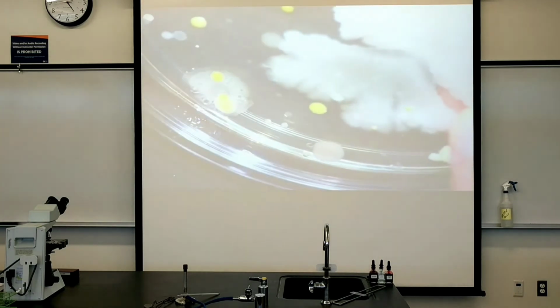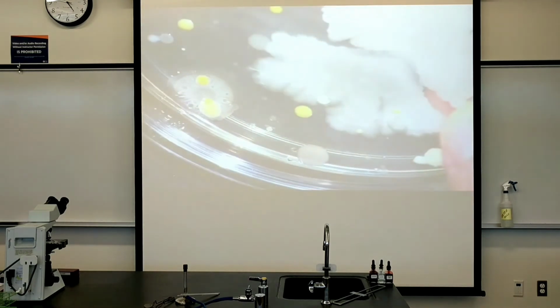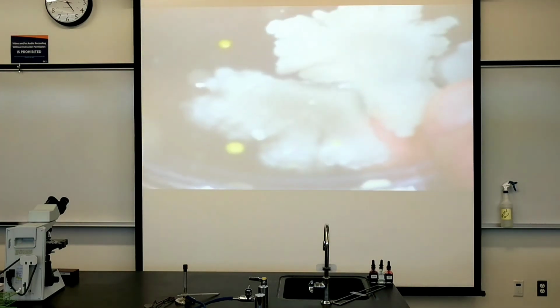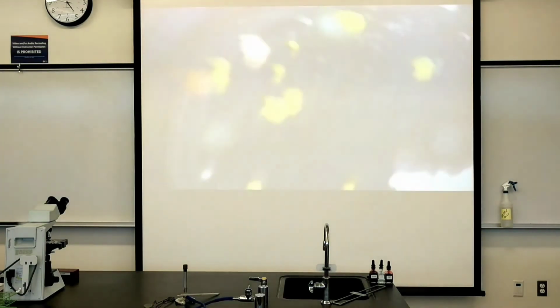These look like they might be a little fuzzy to the eye, but that's typically how bacillus species look when they're taken out of the soil and grown on a plate. So not everything that's fuzzy looking is always fungal. It could still be bacterial. Let's take a look at the cell phone. Were there any fungi on my cell phone?